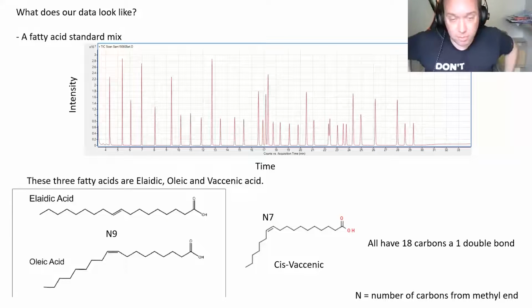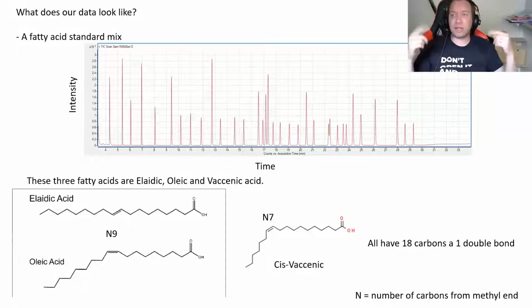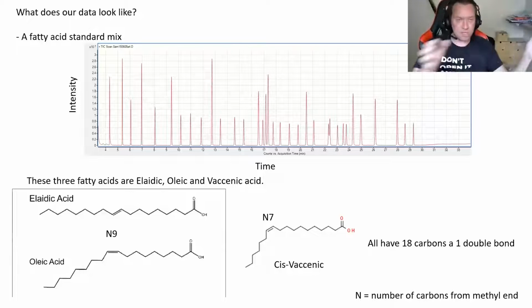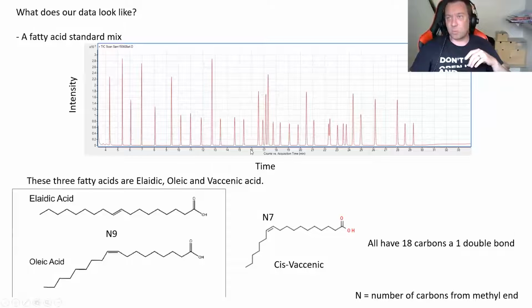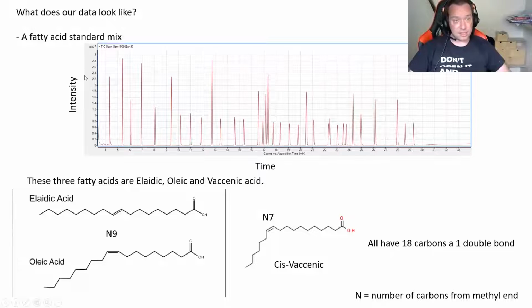Okay, what does data look like from a mass spec? It's basically a line. What we have here is something called the total ion chromatogram. I already mentioned we're usually scanning ions from 50 to about 450 daltons, and what this does is it simply sums up over time all of those ions. In fact it splits into quarter seconds because we do these 4 hertz scans. So these are minutes along the x-axis, and the total amount measured every quarter second gets plotted as a point. And so the more stuff we have, the higher the peak, the intensities on this side.